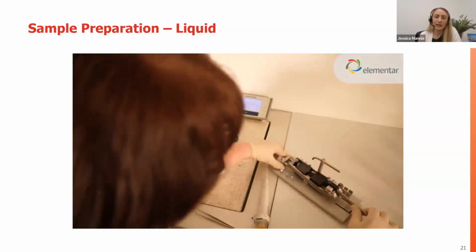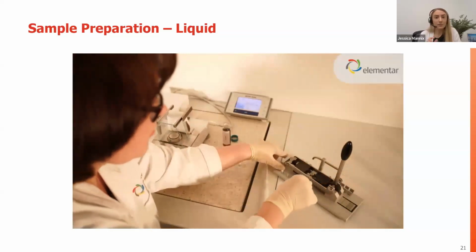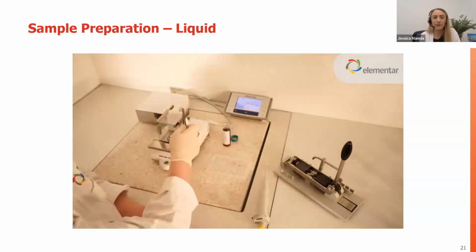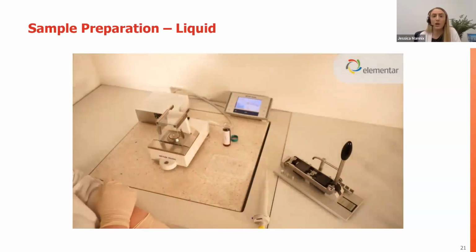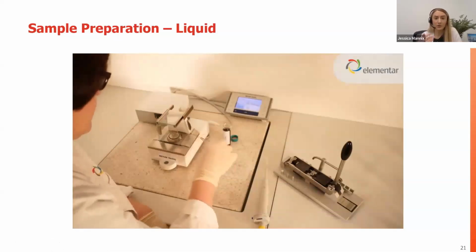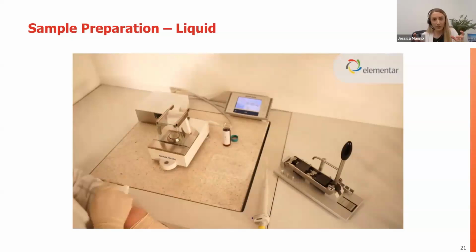After she enters the sample, which is a little bit easier with a micropipette since you can control it a little bit easier, she puts it in what we call the capsule sealing press. What this does is just makes a complete seal on that capsule as compared to squeezing it with the forceps in the previous video, just to ensure that there's no ambient air inside. There is also a flush option, if you can see right here on the side, if we wanted to connect a carrier gas to it in order to flush any ambient air out at the top. There's also an option to overfill capsules and kind of clean them up with a Kim wipe in order to prevent any headspace from forming in the top of the capsule.